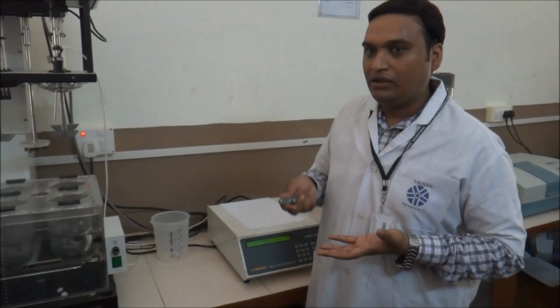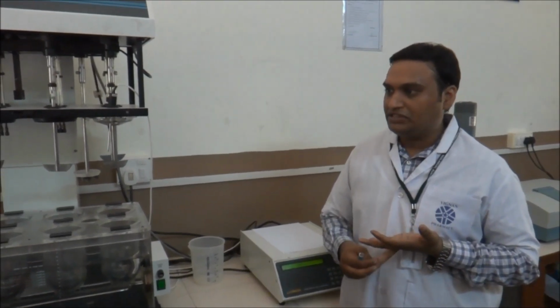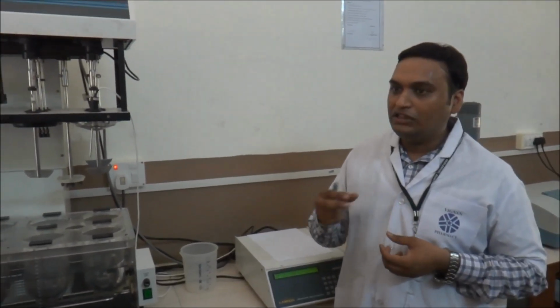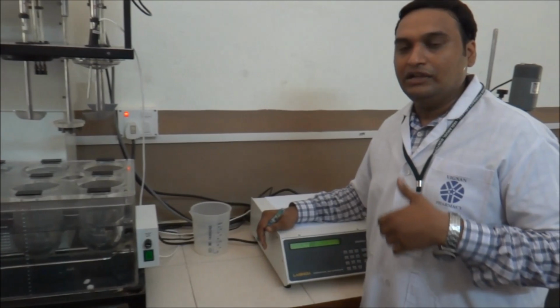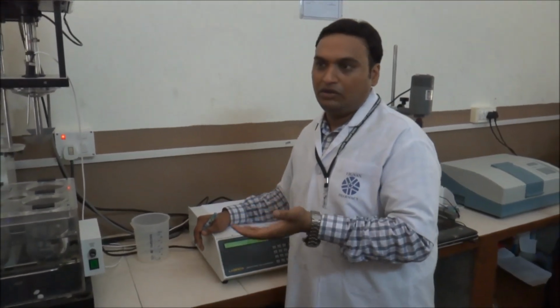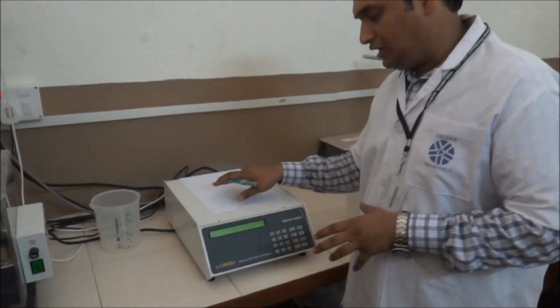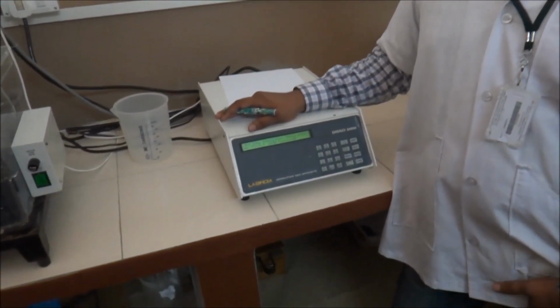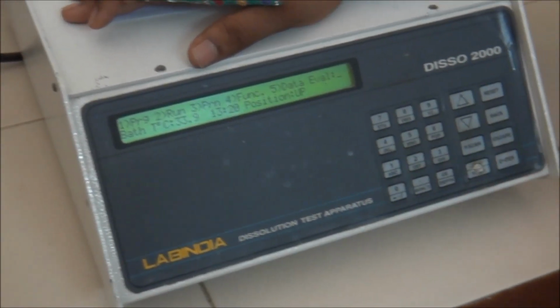Depending on the requirement of your tablet, you have different requirements like different RPMs, different temperature conditions, different buffer volumes, or different sampling intervals. All these variables you have to predefine to the system so that the system will automatically do whatever you are ordering it to do. Therefore we are going to input the parameters into the CPU system. Let us see how these CPU parameter inputs can be given and how we can add, delete or modify a program.